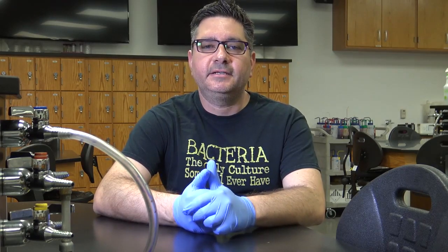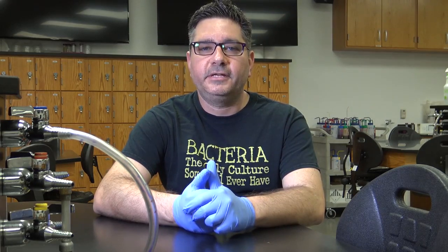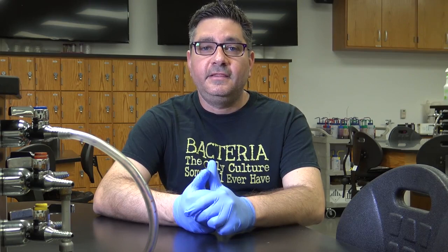Media is dissolved in distilled water prior to dispensing. At this stage, the medium is not sterile and has many microorganisms from the utensils used in measuring the medium, the flask that was used to make it, and from the environment in which it was made. This holds true for any medium that is prepared.